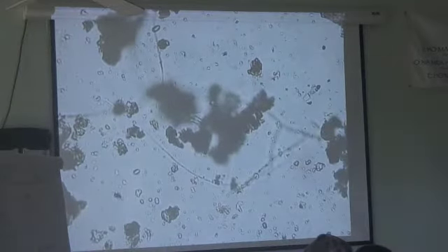This head goes to the port to put this into the projector. You have to remember to open the port that allows light; part of your light is going to your projector. So notice when I close this down, there's no picture. And I'm going to open this up. Half, part of my light is coming to my eyepiece and part is going to your camera.